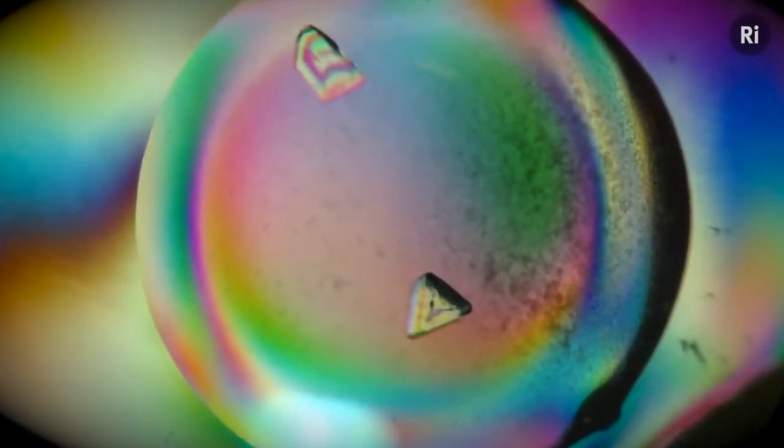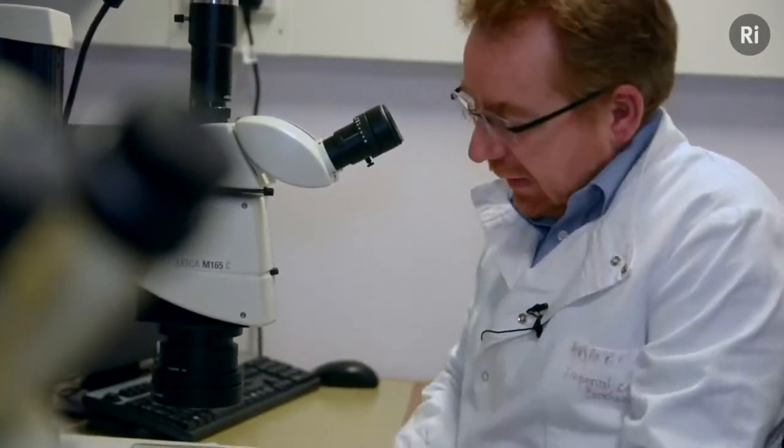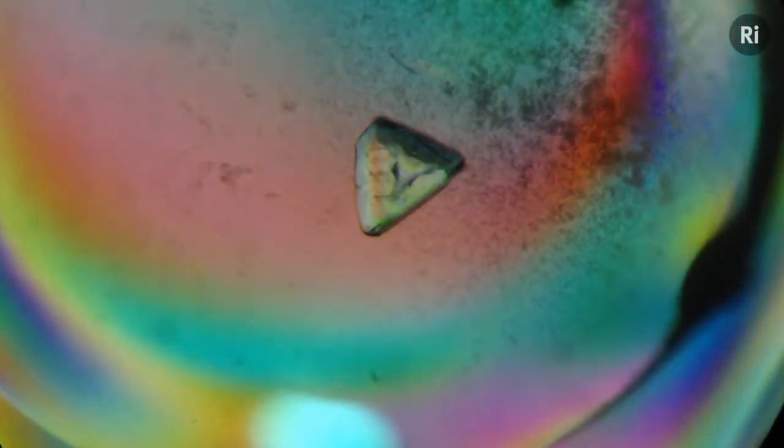So what do we do with this information? How do we convert these diffraction patterns into molecular structures? Well, I can see my crystals down a microscope like this fairly easily. What I'm doing here is using lenses to make a magnified image of a tiny object. And that works because the lens can recombine or focus the light scattered from an object to make an enlarged image. Because a molecule is much smaller than the wavelength of light, I'm never going to be able to see it using an instrument like this.